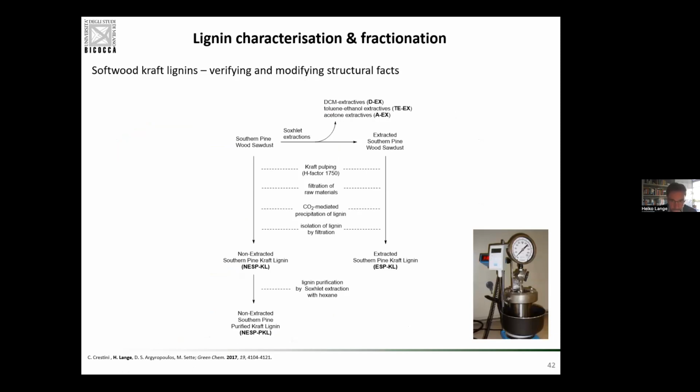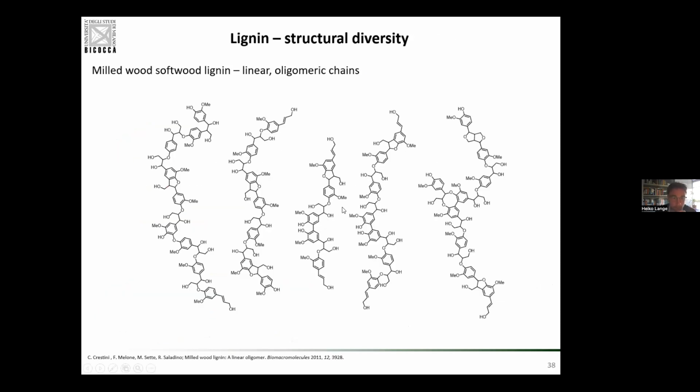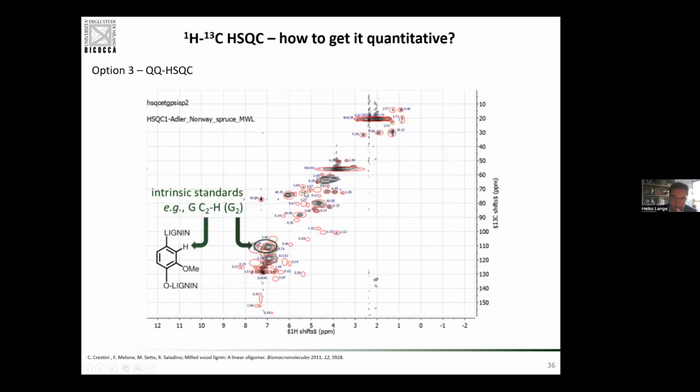If I do that, let's take one step back. If I do that, I would end up with this brown powder here, and I can analyze it. I can do just what I've said, and I come up with a much better picture, like, for example, this one here. If I want to make my life a little bit easier, and especially if I want to see eventually impurities that are in a standard spectra hidden as very small peaks, or as peaks that, zooming in, zooming out, I would identify maybe incorrectly as noise, etc., I can do one step in between taking the powder as it comes and doing my NMR analysis.